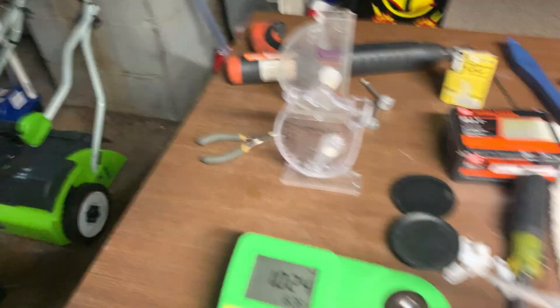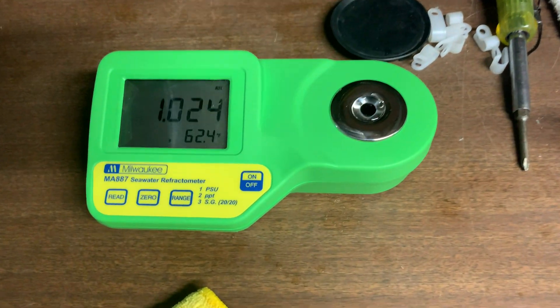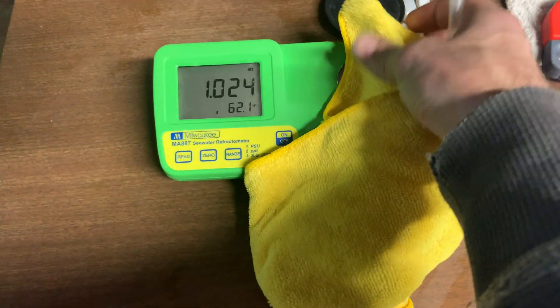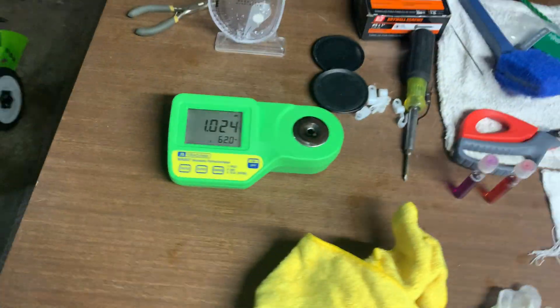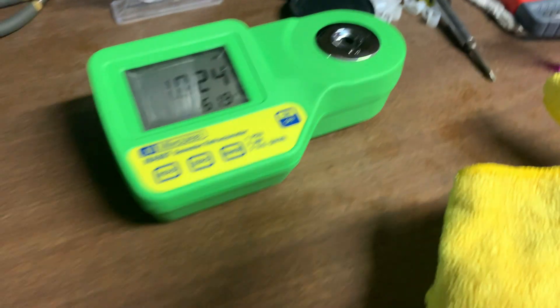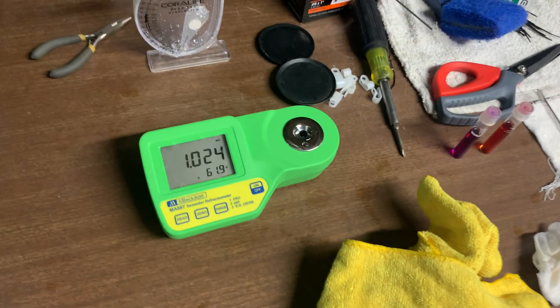Let me suck that up and take a reading on that one. And let's see what that one reads. It should read about the same and it does. So that's exactly what that water is. So far that is three different samples of water, all reading spot on on the first try. I know this because I've already taken these samples like a dozen times, experimenting with all the different testers. And here's another one — this is my other water. Let's put some in here. This one should be around 1.023 to 1.024. And what do we get? 1.024. Once again, that's exactly what that water is.